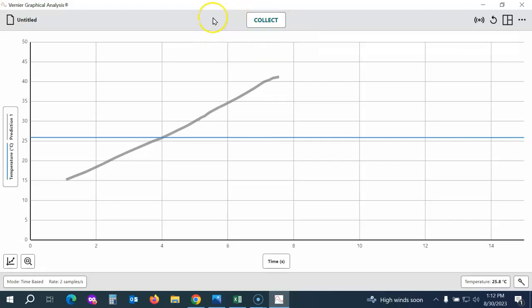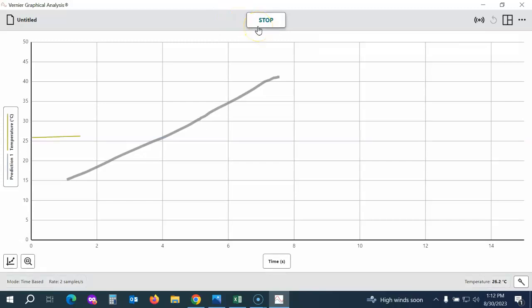I can see I'm back to Collect at the top, which means my data collection has finished. Now I'm going to collect my second round of data. This time I'll hold the temperature sensor in my hand and click Collect again. You can see we're collecting data in a new color, and because I'm holding it in my hand, the line is rising. They can stop data collection early if needed, but it will automatically stop at the end of the set time.